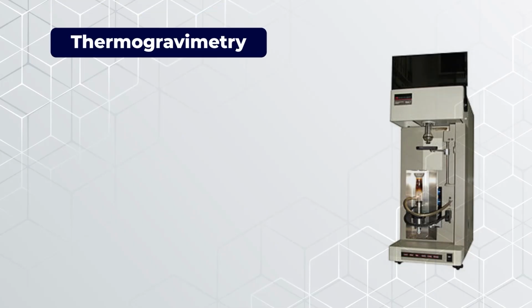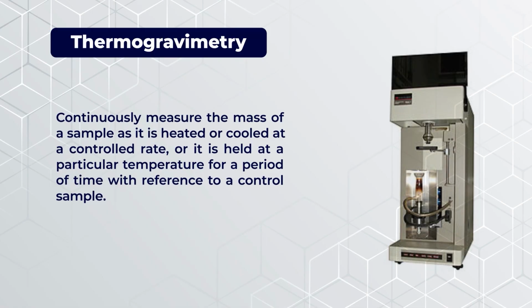Let us talk about the technique thermogravimetry. As the name suggests, thermo and gravimetry. What we do here is measure the weight of the food sample which is being heated at a constant, given rate, and with time we measure the weight. So we plot the loss in weight against temperature, that is thermogravimetry. To say it, we continuously measure the mass of a sample when it is heated or cooled.